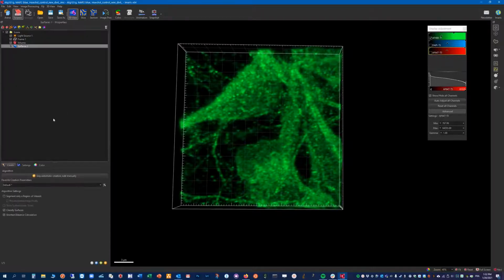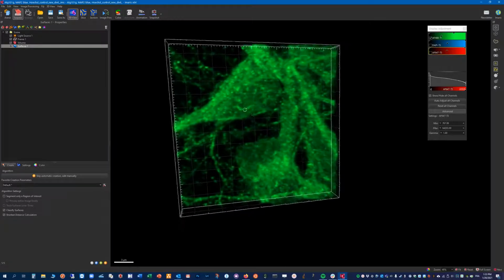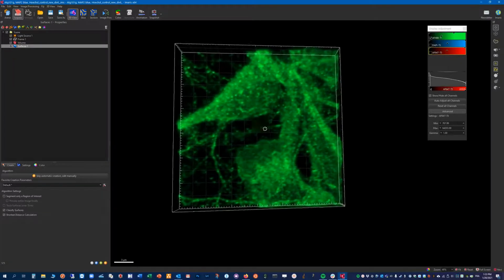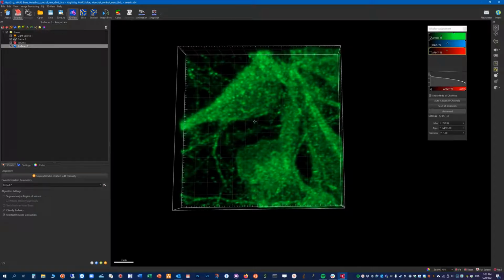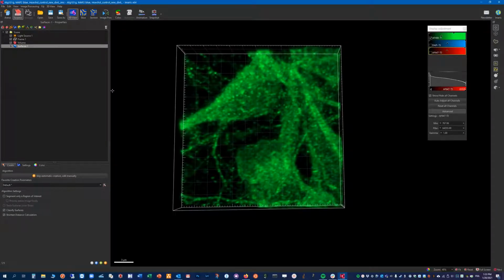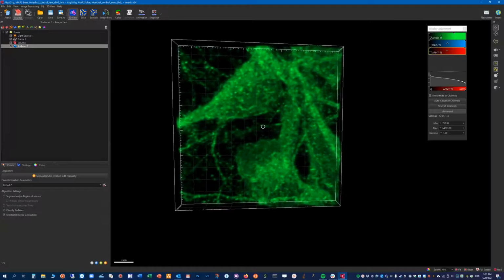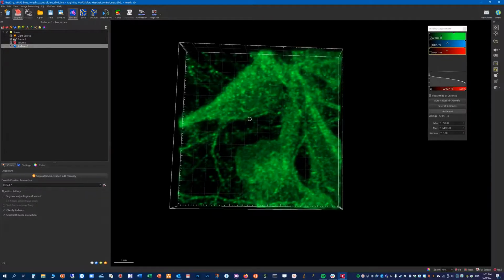So let's start. As always here, it could have been a good idea to refine the dataset a bit by doing some filtering and maybe resampling. We will stick with what we have right now and see if it works well enough.